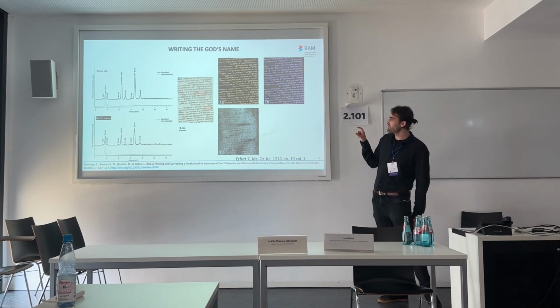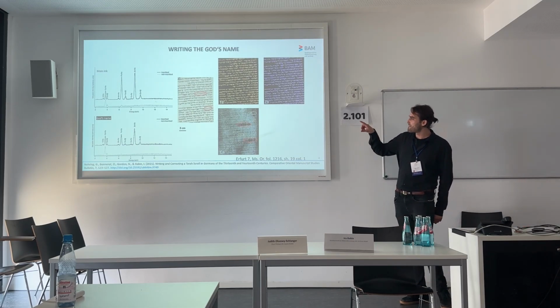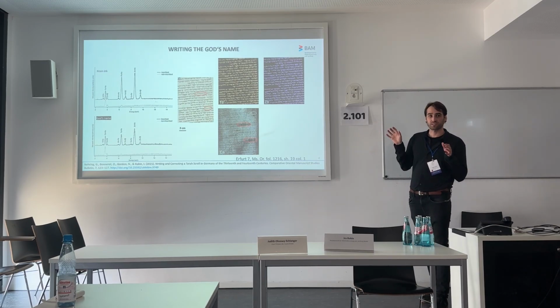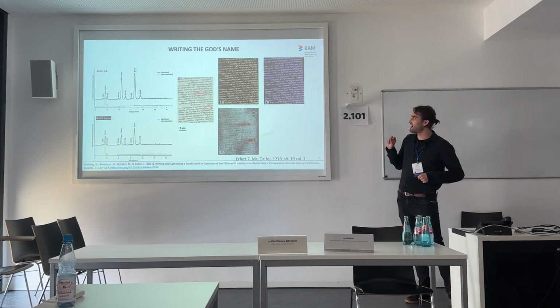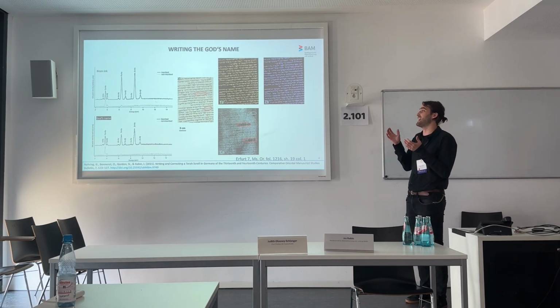We see two black areas where the signal of calcium is much lower, now encircled in red, where the corrections which Nehemia was interested in studying have been introduced. And in white, I highlighted the areas where the God's name was supposedly added.